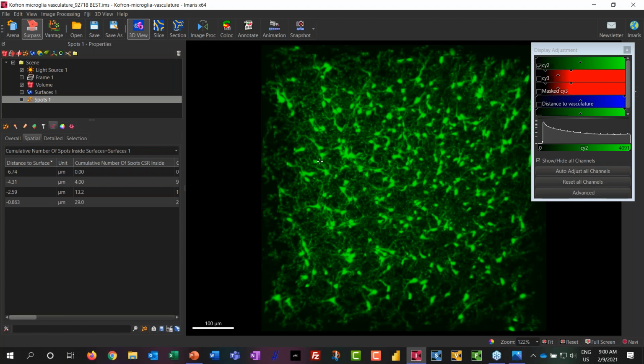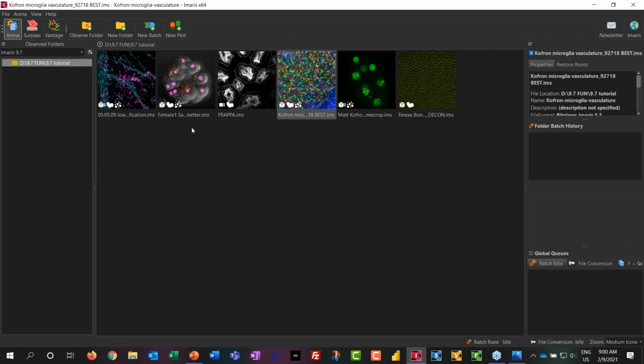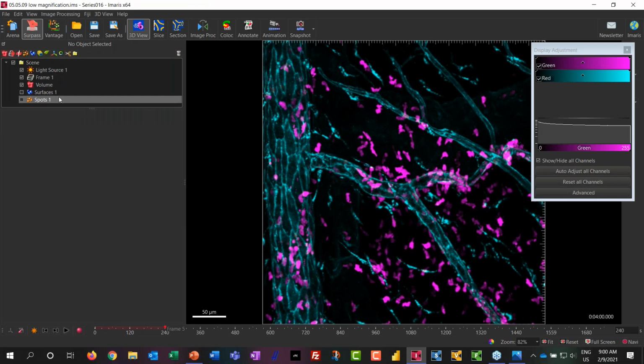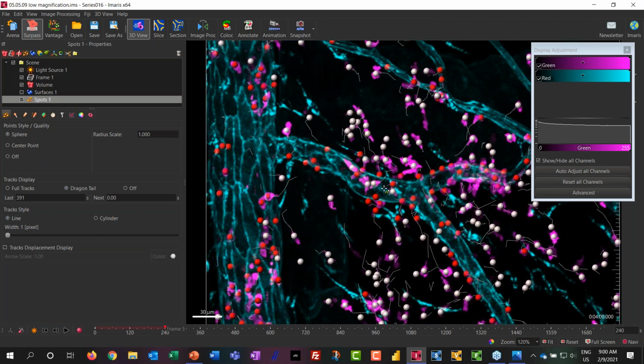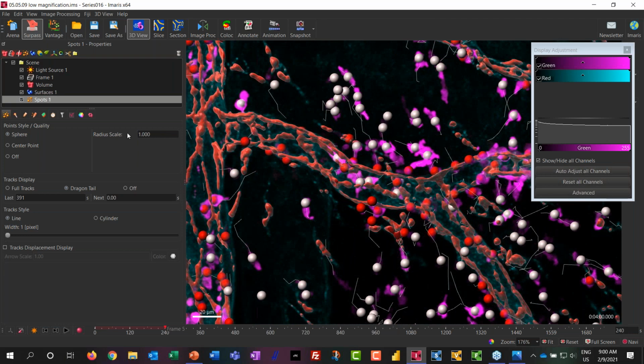There was also a question about providing some examples of contact duration, but I'm not sure if we still have time for a demo or whether we cover it later. I can quickly show it. In this case, contact duration is based on how I set it up: the spots in red are close to or contacting the vessel labeling, which you see in red as well.